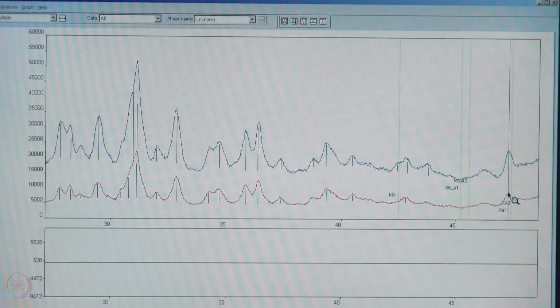So, this shows that the presence of K beta becomes more and more significant for all kinds of peaks, small angle to high angle, very weak reflections to strong reflections, and hence it will create problems in data indexing. So, always we must remove K beta either at the end of the source, that is before the diffraction occurs, or before the diffracted beam meets the detector and generates signal, the K beta filter has to be placed. K beta filter can be placed immediately after the optics, before the X-ray falls on the sample, or after the diffraction occurs from the sample and before the beam reaches the detector.